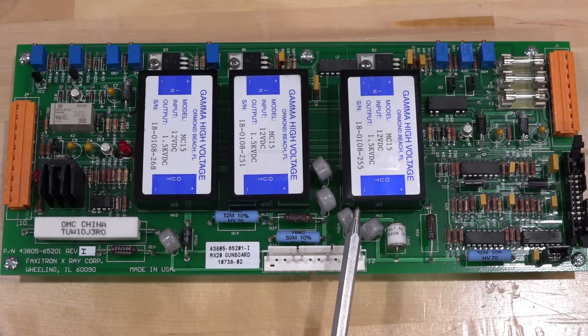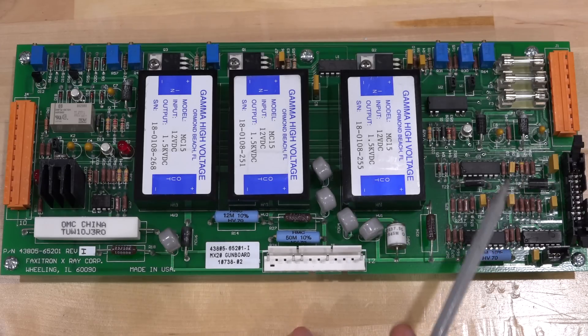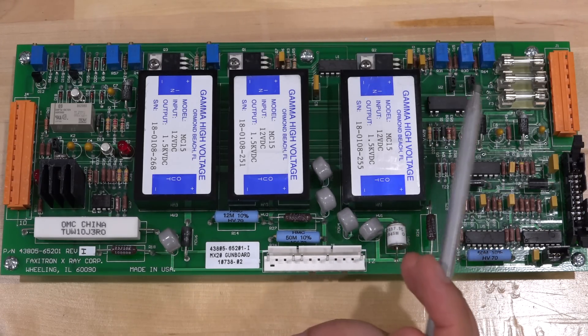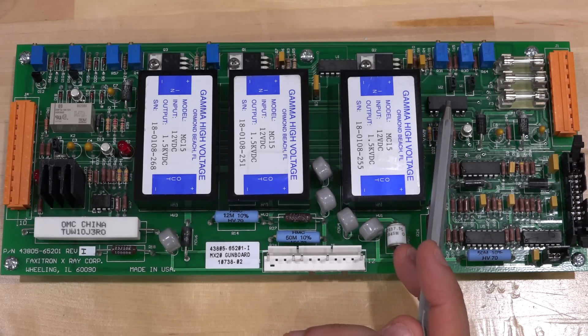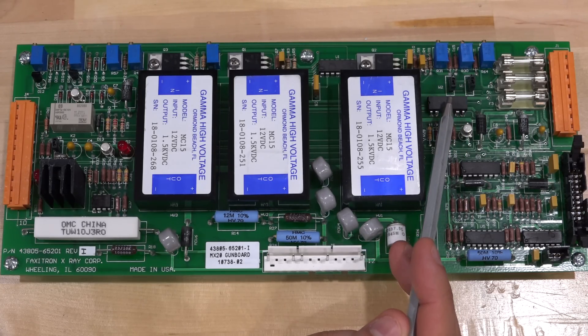Looking at the solder mask labels and the potentiometers, there must be a DAC somewhere else sending an analog voltage to this board. It goes through a couple of op-amps, then a reed switch, then another op-amp, and ultimately into the first HV module — which I suspect handles the focusing. The reed switch is in series with the voltage controlling the focus. If the reed switch is intermittent — sometimes working, sometimes not — it could explain why the image goes from out of focus to suddenly in focus after some time.